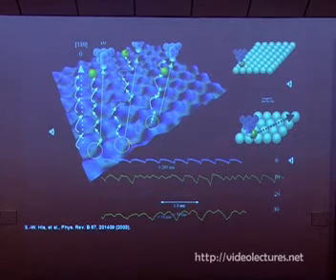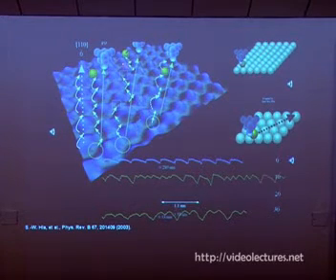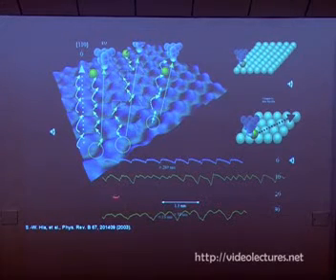So how do we find out? We record the manipulation signals. For example, the top signal shows how the atom jumps along the 110 directions with single atom steps. When we change the tip direction by 10 or 20 degrees, the atom cannot follow exactly. The atom prefers to diffuse along 110 because of the lower diffusion barrier, but the tip is moving along other directions. So it moves in a zigzag, this kind of movement. We can record it here in this manipulation signal. And in this other case, the atom moves more smoothly.